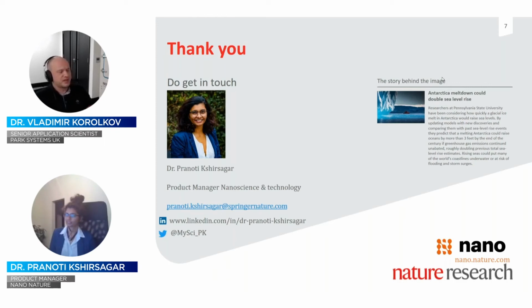It's actually a very good point. In general, yes, when you scan something with your probe, of course, occasionally you may pick up things, especially if you're scanning something that is loosely bound to the surface, or there's some contamination there. But the beauty of Teflon is that it's the material with the lowest adhesion known in nature. That's why there's almost no contamination on top. The adhesion between the probe and the surface is very low, so not much sticks to the probe.